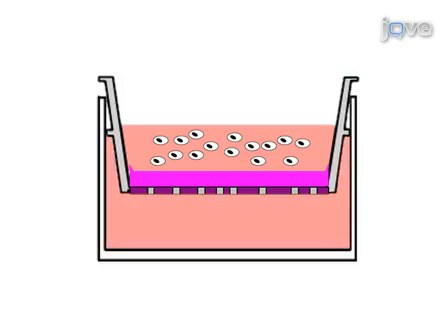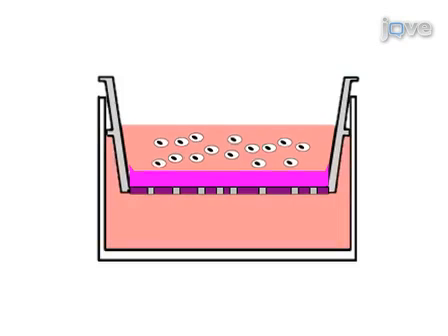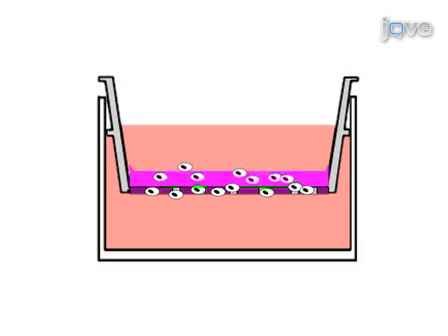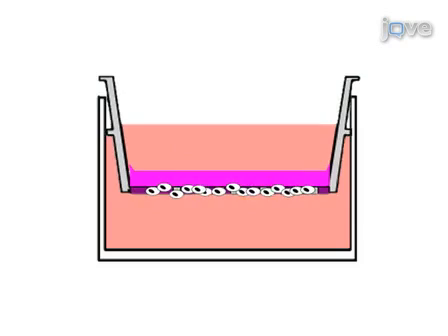Chemoattractant is added to the basal chamber and the system is incubated overnight. Invasive cells will be able to degrade the matrigel barrier and pass through the fluoroblock membrane, a specialized membrane that protects fluorophores from ambient light.